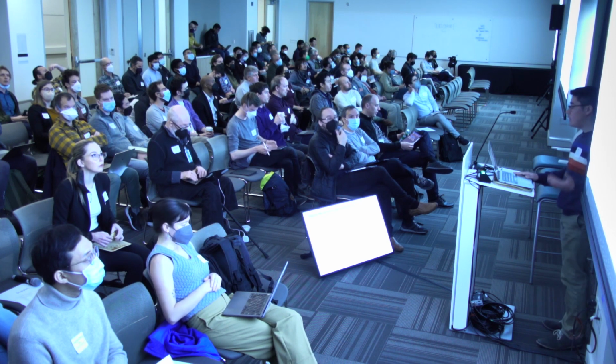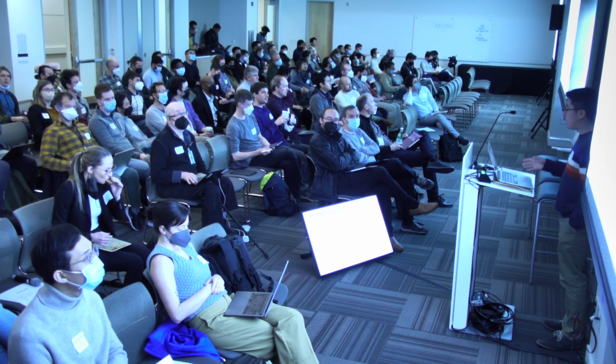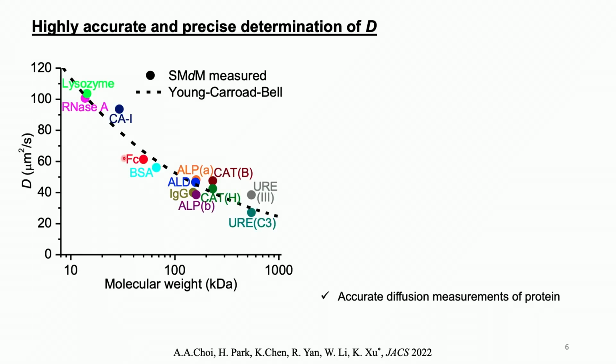A second discussion I wanted to mention is my work on testing the limits of SMDM tracking capabilities, and doing so in an accurate and reproducible manner. Here we applied SMDM to determine the diffusion coefficients of a variety of different enzymes, ranging from as low as 20 micrometers squared to as high as 100 micrometers squared, demonstrating SMDM's capability of monitoring a wide range of diffusivity coefficients in freely diffusing proteins, and did so in a way that matched theoretical and previously measured reported values.